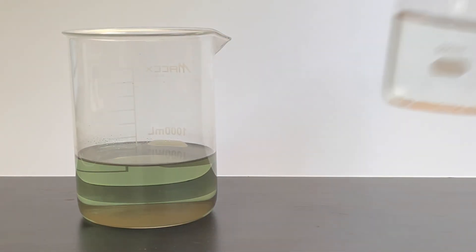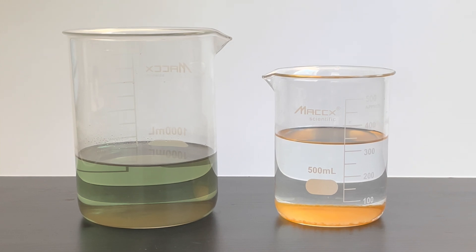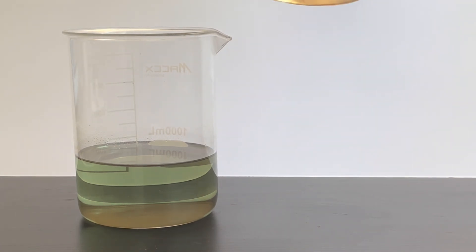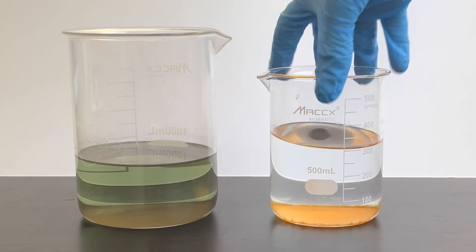Today I'm going to be combining two incredibly toxic solutions. This first green one and the second orange one. The green one is a highly acidic solution of nickel 2+, iron 2+, iron 3+, and a few other metal ions that I really don't know. This orange one is a highly basic solution with a suspension of probably aluminate at the bottom.